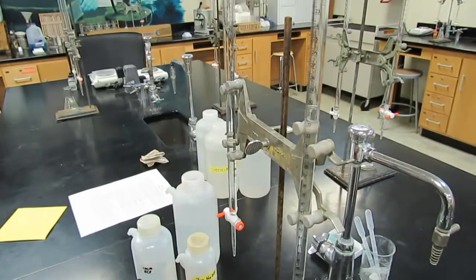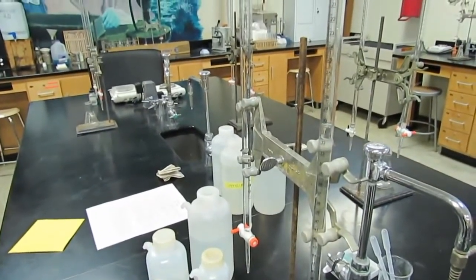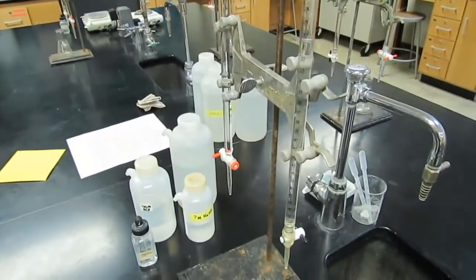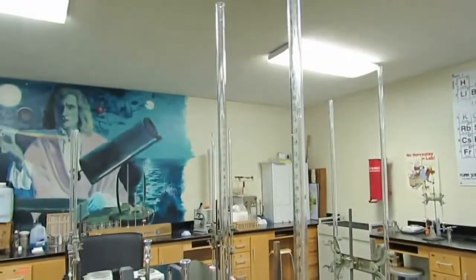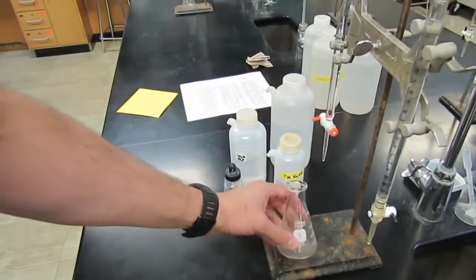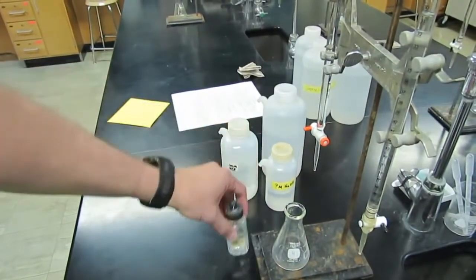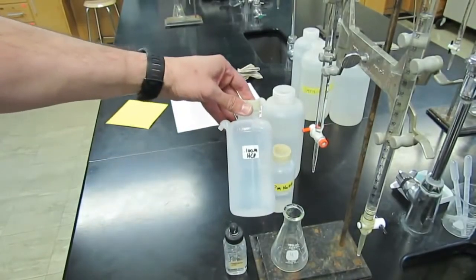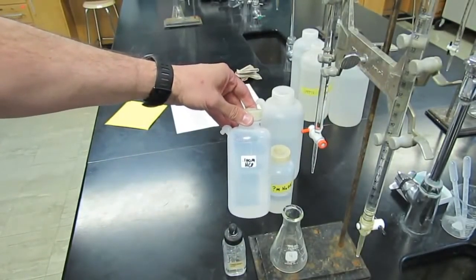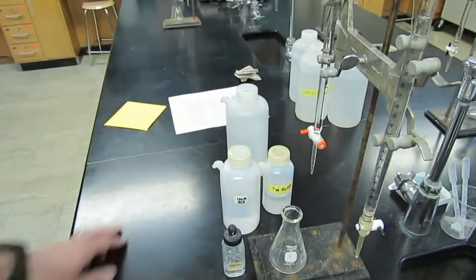Okay, welcome. Today we're going to be doing an acid-base titration. We have some pretty standard equipment here. We'll be using these burettes. We'll talk about how those are used during the experiment. We have a 125 milliliter Erlenmeyer flask, some phenolphthalein indicator, some 0.100 molar hydrochloric acid, and then we have a bottle of distilled water.